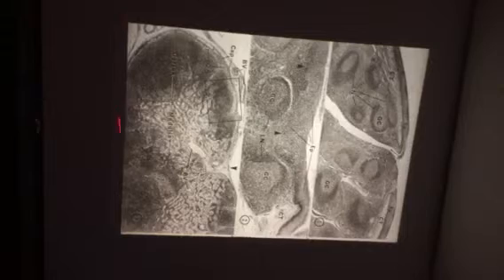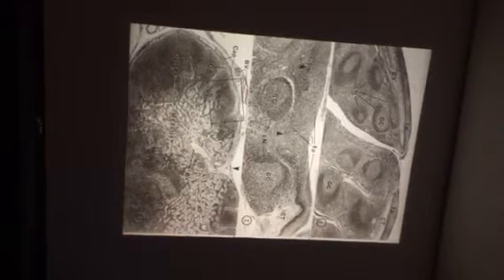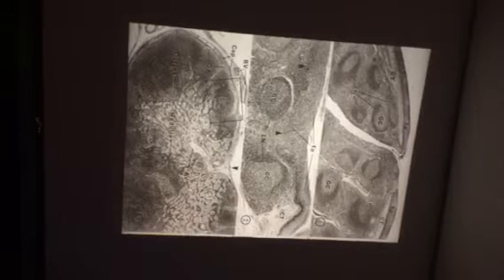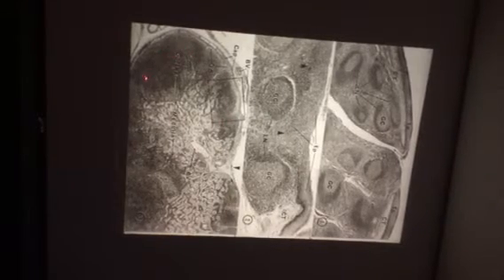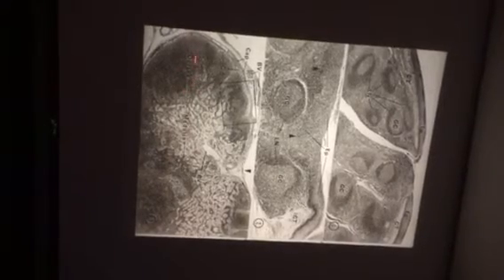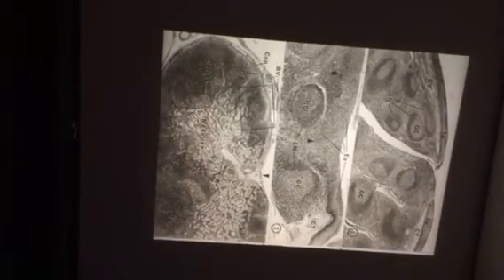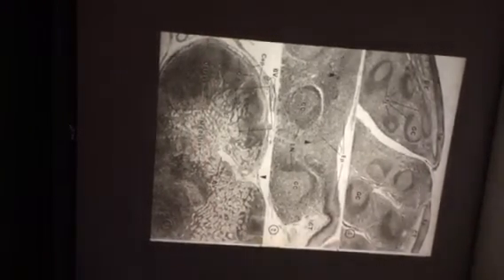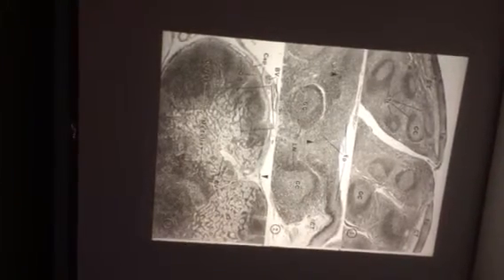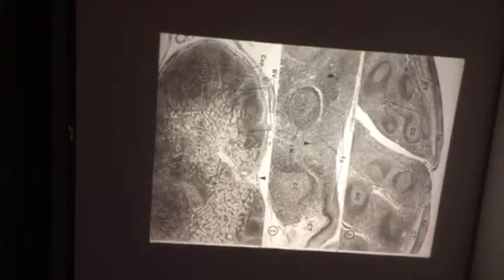And this organ right here would be what? Lymph node. And out here, this portion of the lymph node is what? Cortex, and this portion in here would be the, I know, boy, you guys get that really quick. Okay, and out here we have the capsule. So there's the capsule right there.